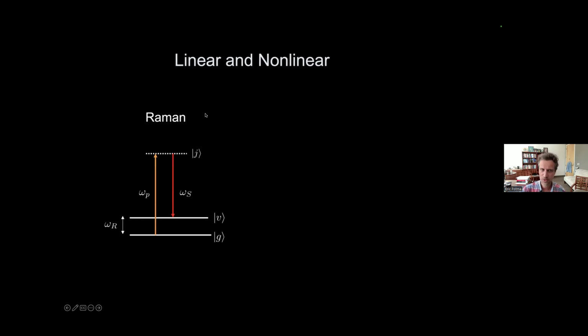So the Raman process in the same kind of quantum mechanical picture can be visualized as follows. I have the ground state again, and then what I want to see is this vibrational mode, okay? This ground state vibrational state of the molecule. I want to excite that. And the Raman uses a very interesting way to do it. It actually doesn't do it directly, it does it indirectly. So you send a photon in, you don't excite a particular eigenstate of the molecule, but you let spontaneous emission happen such that you couple back to this vibrational state. So it's an indirect excitation process.